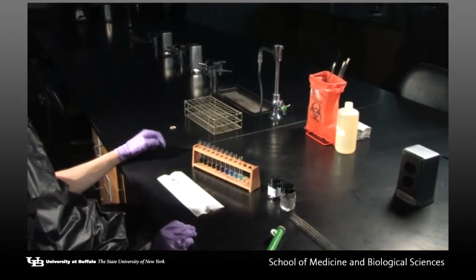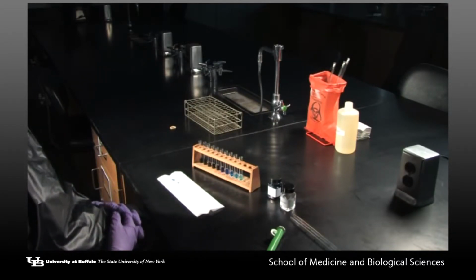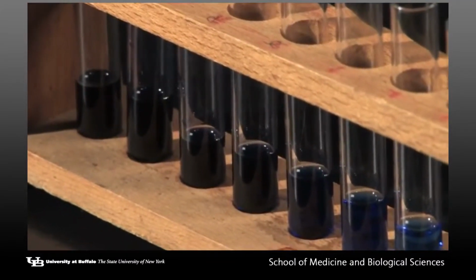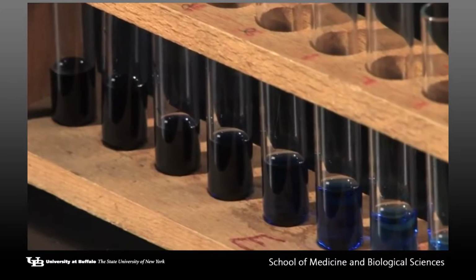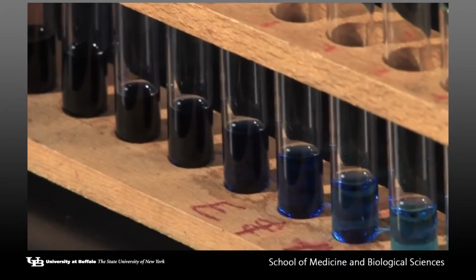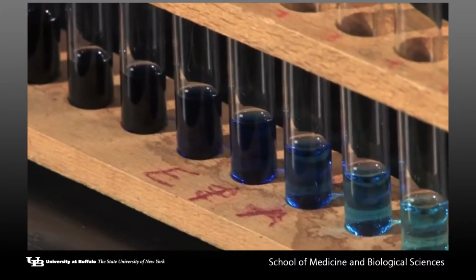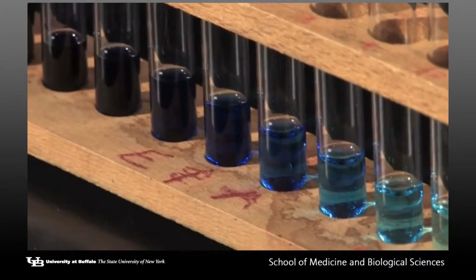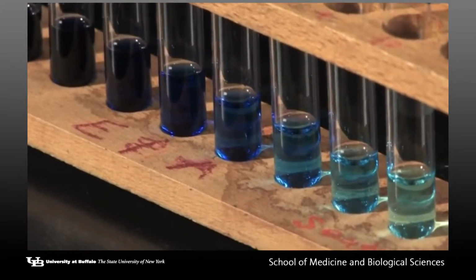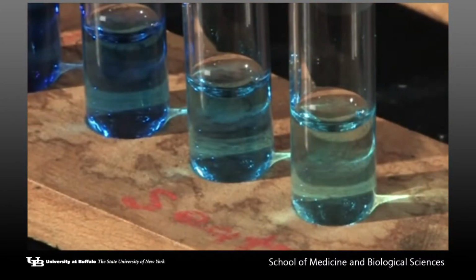Tube 1 is undiluted and tube 2 is the first in the series of dilutions, which is a 1 to 2, followed by 1 to 4, tube 3, 1 to 8, tube 4, 1 to 16, tube 5, 1 to 32, tube 6, 1 to 64, tube 7, 1 to 128, tube 8, 1 to 256, tube 9, and 1 to 512, tube 10.